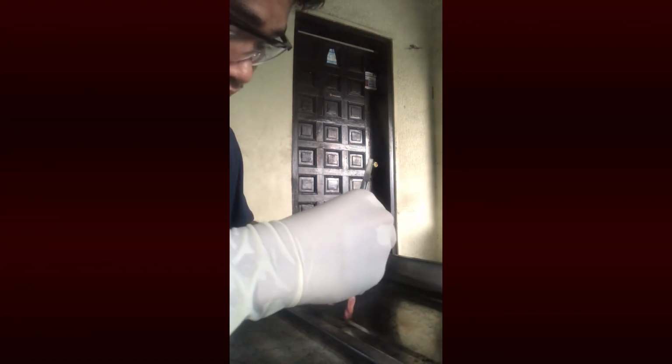Use scissors to cut through the side of the pulmonary artery and continue cutting down into the wall of the right ventricle. Be careful to just cut deep enough to go through the wall of the heart chamber.